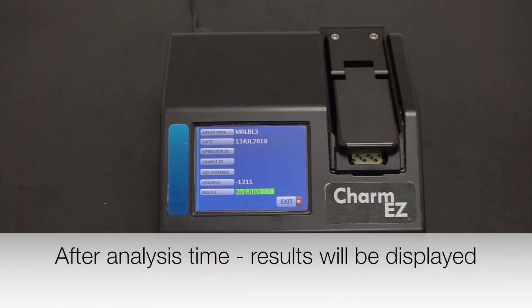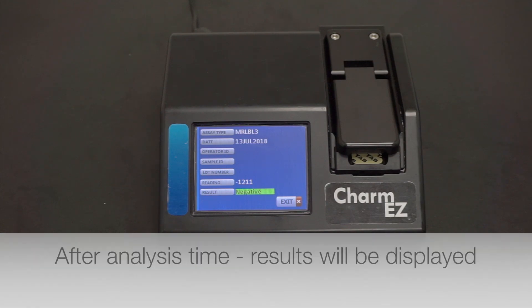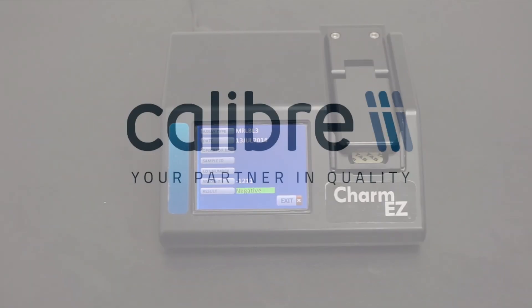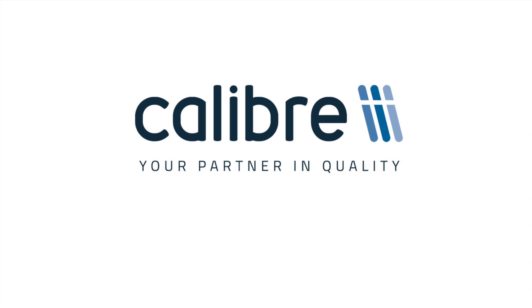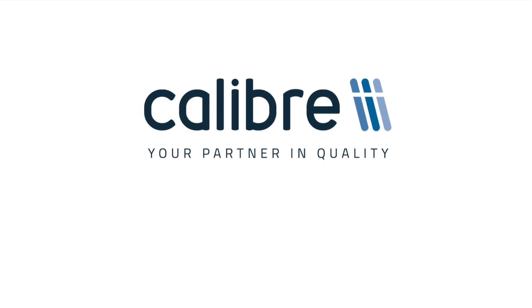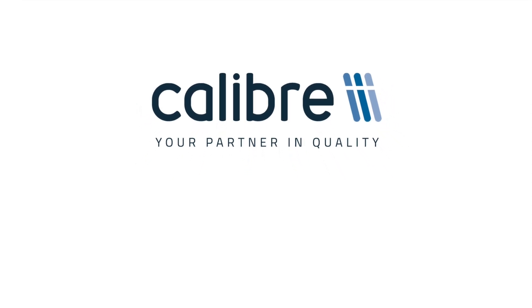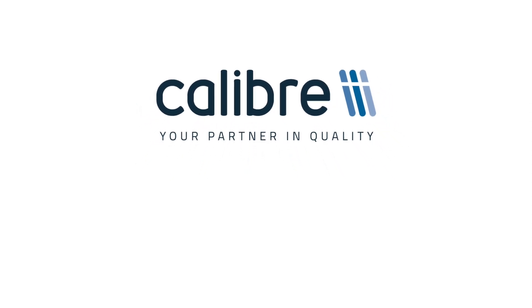The result will then be displayed on the screen.